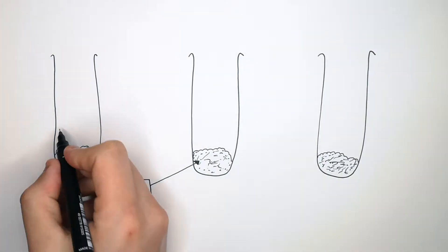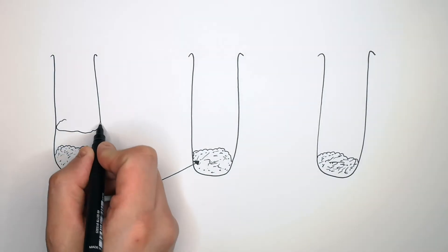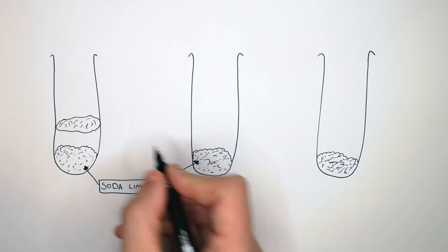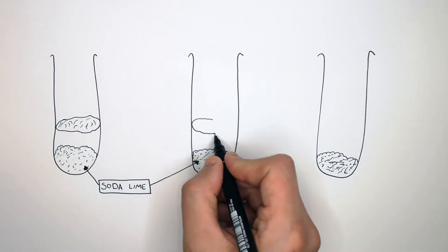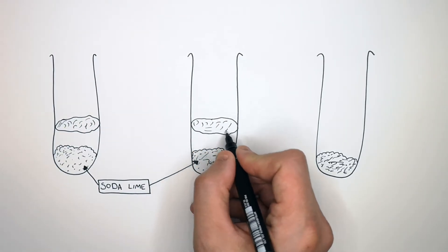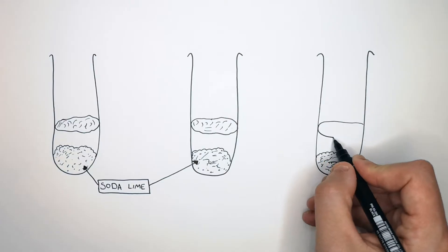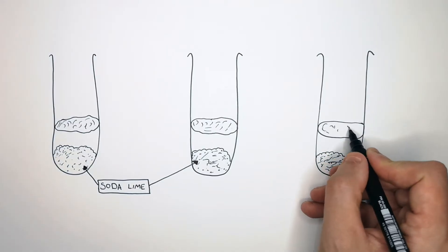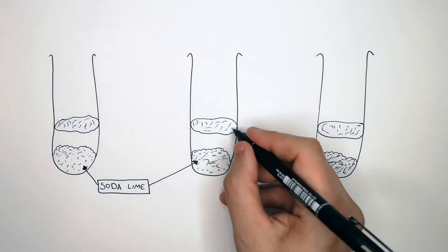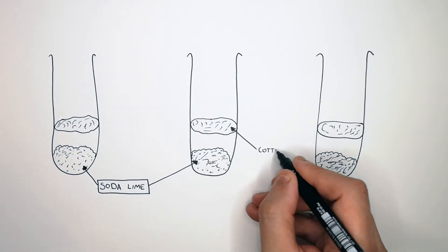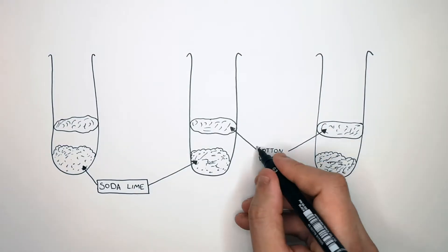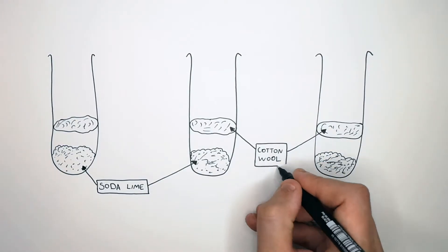You now place cotton wool inside the test tube above the soda lime. This is so the wood lice can stand on it in the test tube. Remember, the cotton wool is placed in the test tube for the wood lice to stand on.